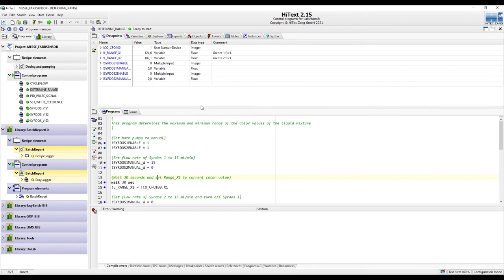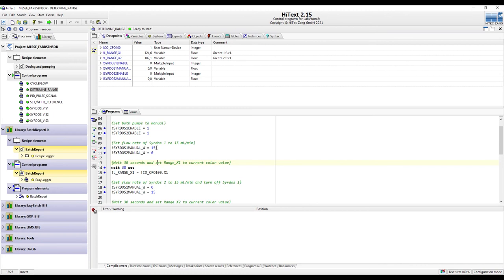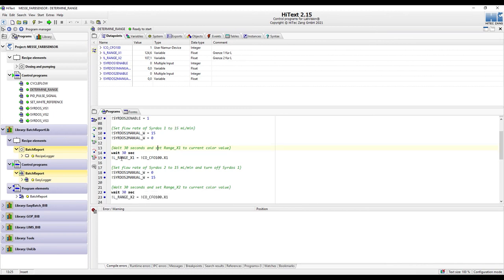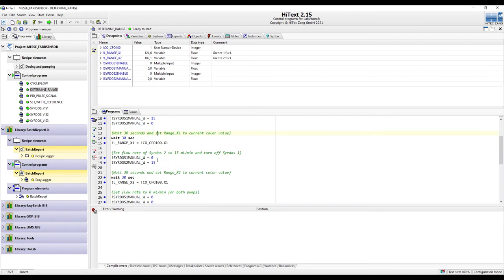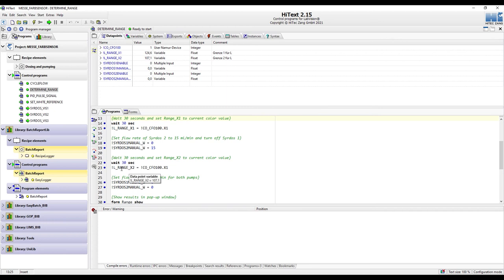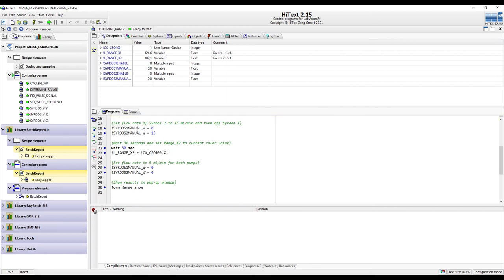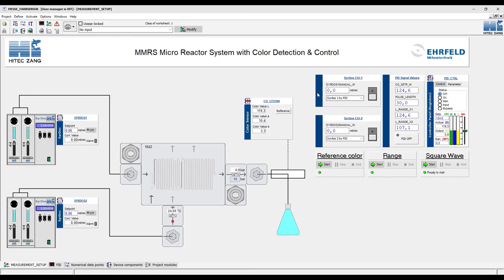I'm going to show you the HITEX program I wrote to determine the range of the color values. It's a rather simple setup: we first enable both pumps, then set the flow rate of one pump to the maximum and wait 30 seconds, then determine the current color value which is saved in a data point also shown in the panel. Then we switch over to the other pump with maximum flow rate, wait 30 seconds to flood the whole reactor, measure the color value again, and then set both pumps to a flow rate of zero. Finally, it will show you in a separate pop-up window the two values determined for the possible color range. This has already been done, as you can see here for those two numbers.